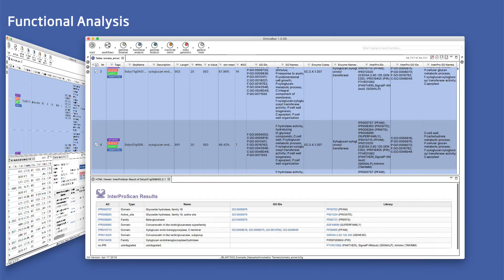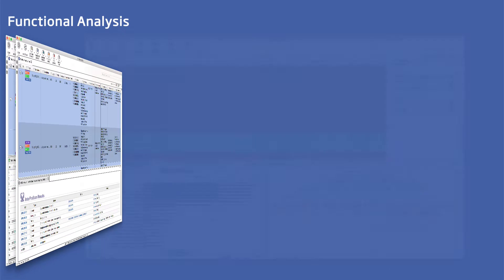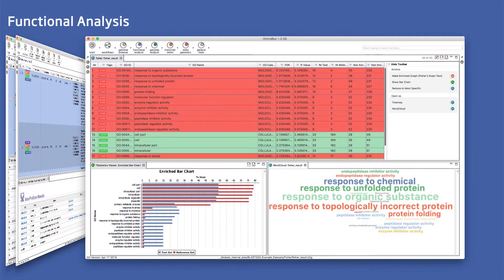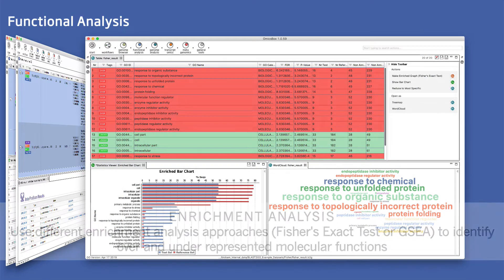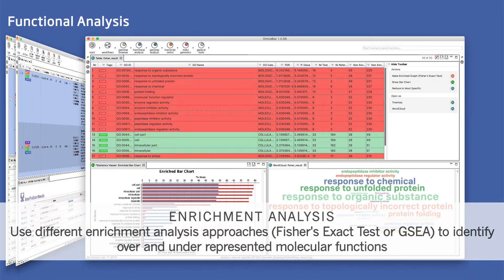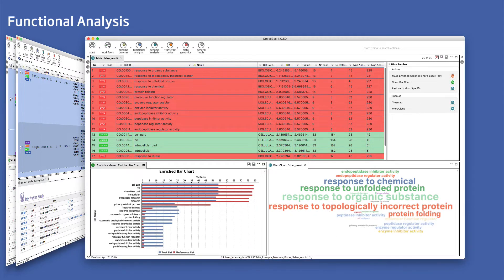Additionally, we can perform gene set enrichment analysis to identify over-represented functions and pathways. Enriched gene ontology graphs and other visualizations help to interpret and communicate results.